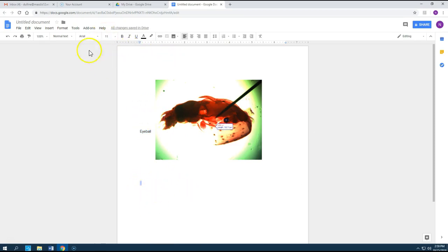And if we can't find a way to do that, you could always do this in a Word document as well. With Microsoft Word, they have tools that can add arrows and things. So that's the end of how to use the Motic microscope camera. You've got 3 different videos that are linked to the lab report entitled The Study of Cells, and you can watch these things as many times as you need to remind yourself of various topics and how to do things. And if you get confused, you can still always ask me. So good luck, and I'll see you in lab.